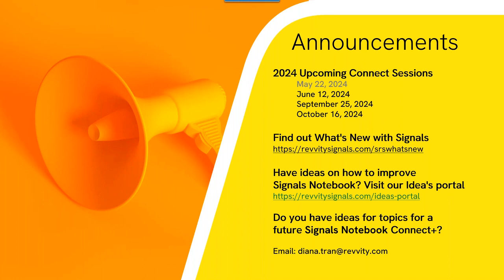The more complicated answer would be, depending on whether you just have the Signals Notebook or you're looking to upgrade into getting the Signals Research Suite, we have a way with the analytics to connect what I would consider somewhat disparate data sets in ways that you may not know is possible. But I'll stop there just to not overcomplicate things.